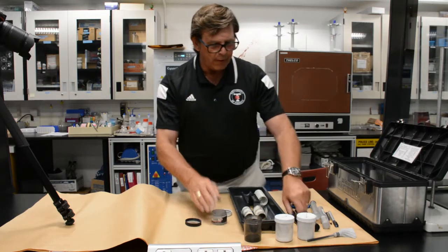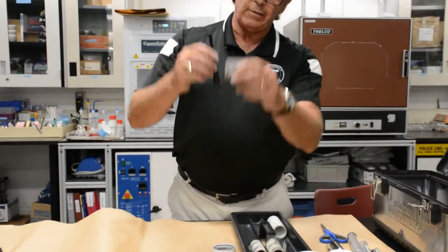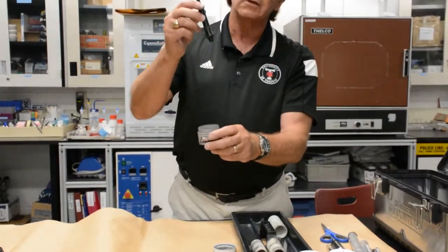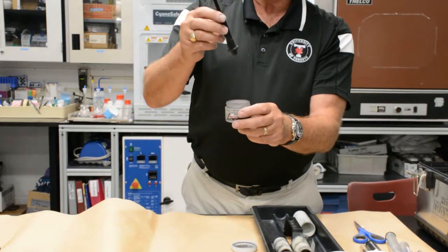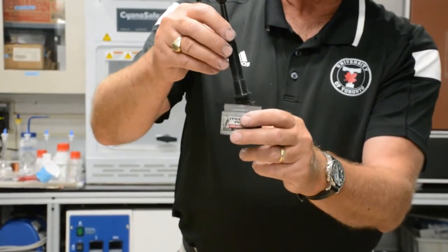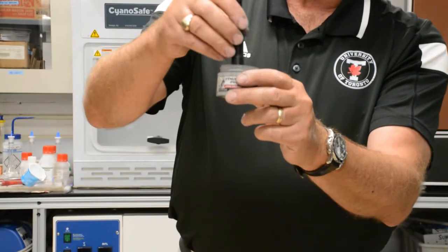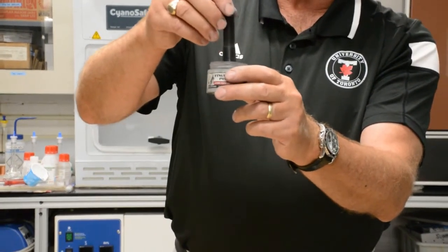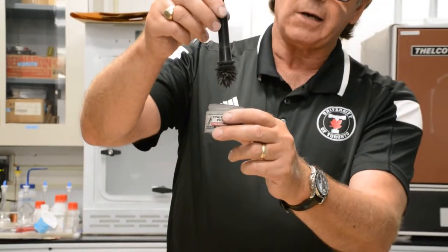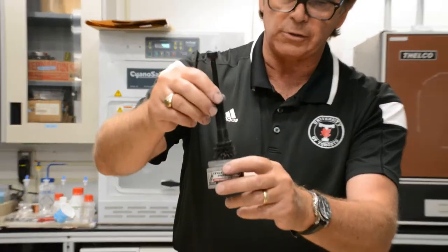Because it has iron in it, it permits it to be magnetized, and so this powder is exclusively used with the magnetic applicator, also known as a Mag 1 or Magna brush. So with the center probe inserted and magnetizing the tip, it magnetizes the powder that's in the jar and picks it up in a ball like this.